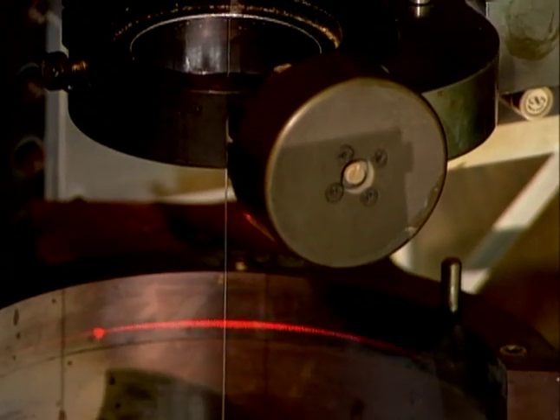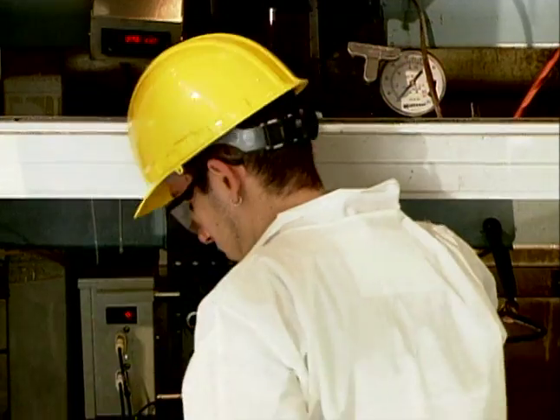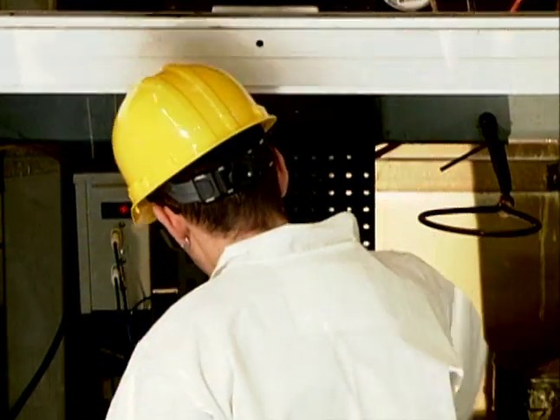As the glass passes through a laser micrometer gauge, minute adjustments are made to assure consistent diameter is maintained to exacting precision.